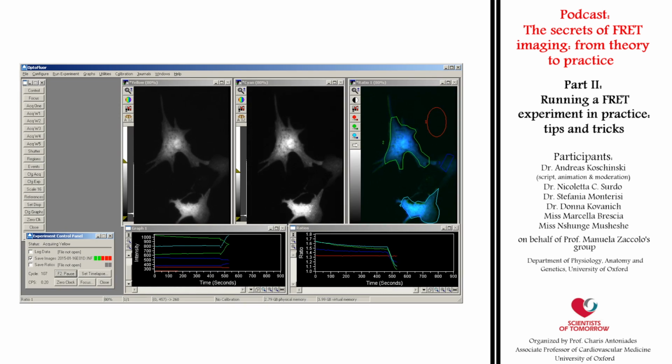Immediately after the addition, the FRET ratio drops. As this is a loss of FRET sensor, this drop indicates the increase of the intracellular cAMP concentration. After the FRET ratios reach a new plateau, the experiment is done and we can move on to the data analysis.